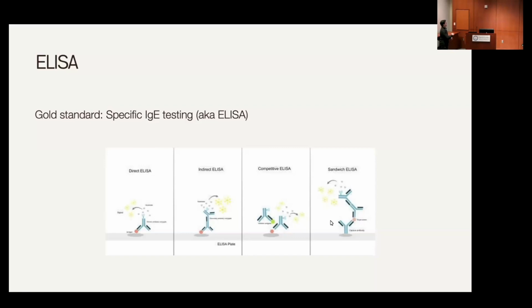We'll go ahead and wash. And finally, the last step will be with the enzyme-linked antibody. And again, just as in all these examples, we'll wash, then add the substrate and see whether or not we have some quantifiable amount of light or color change.